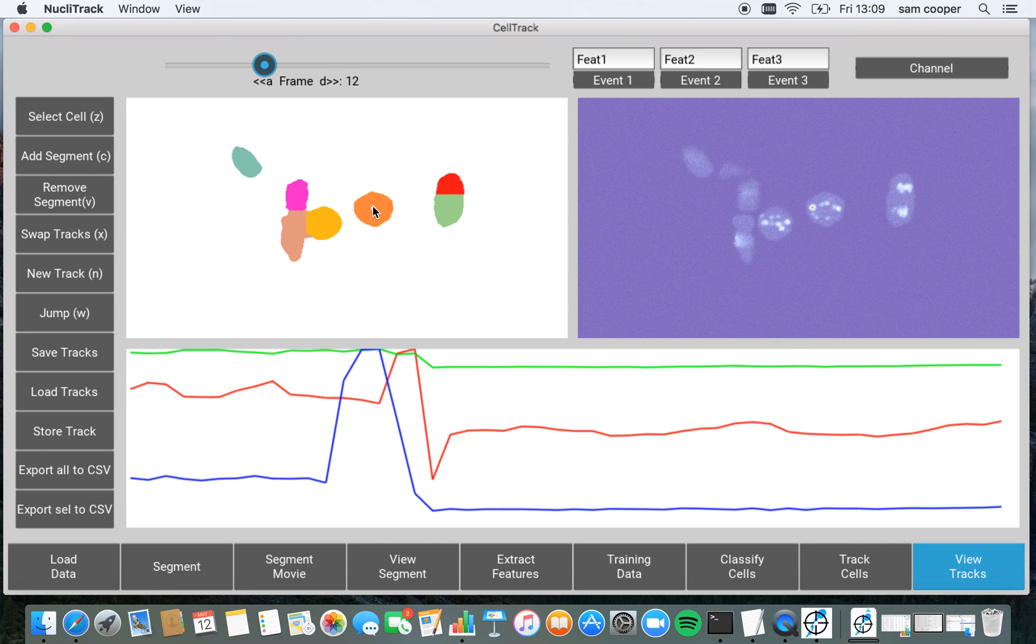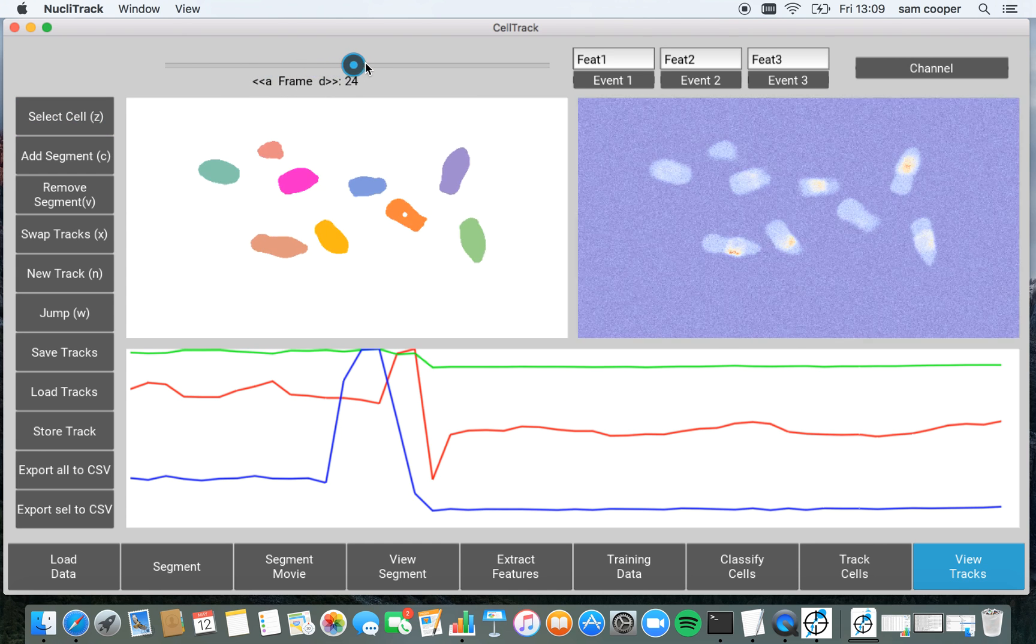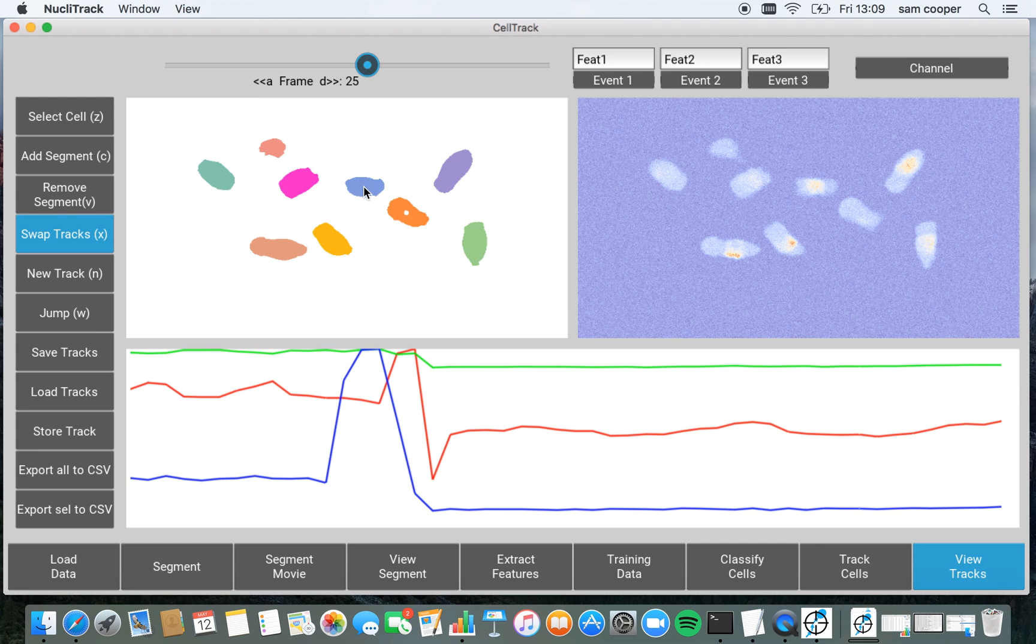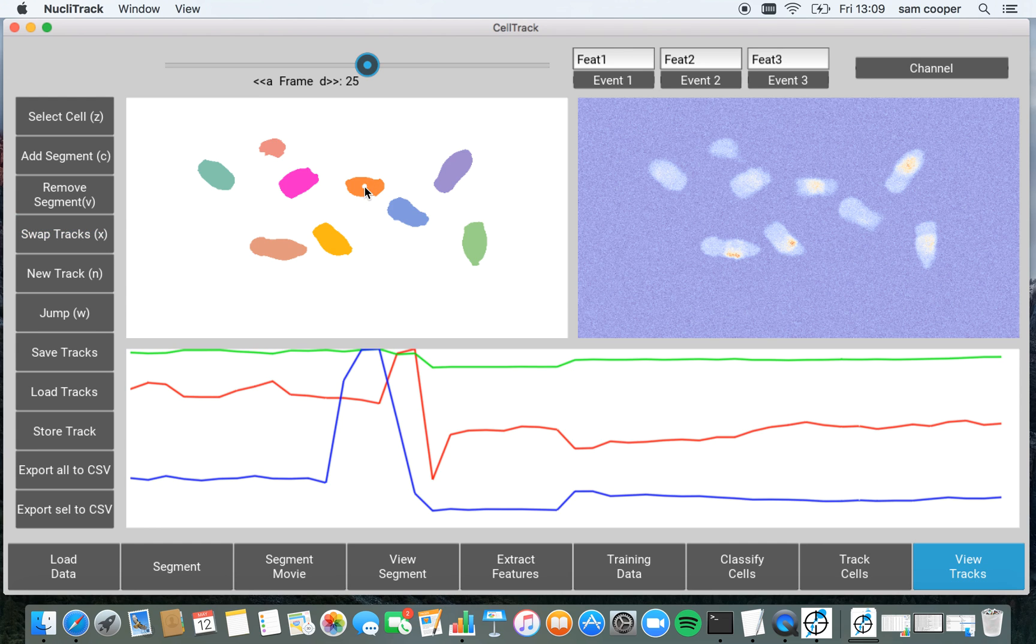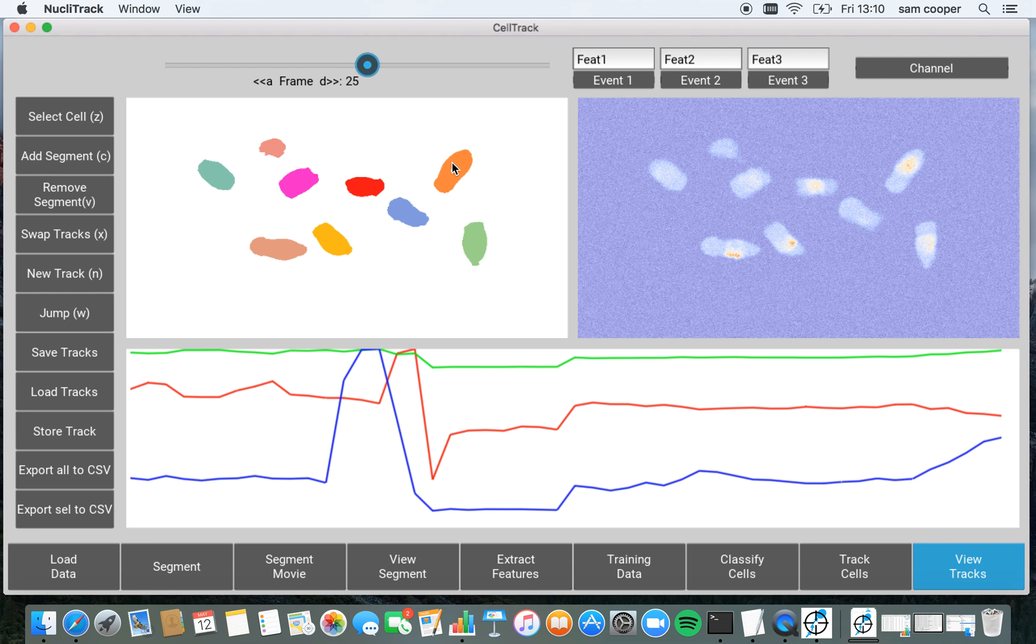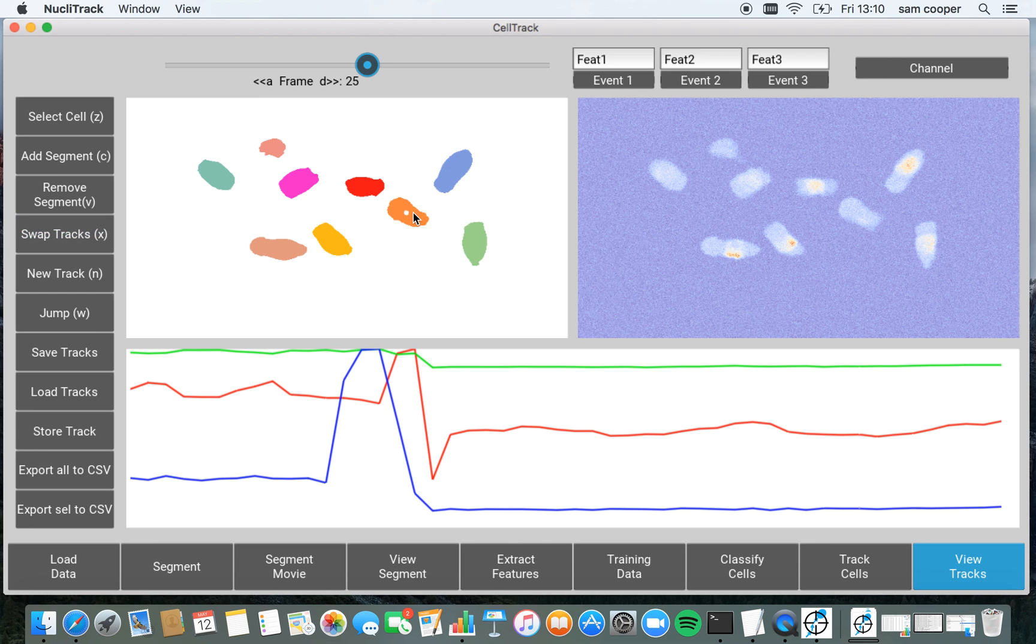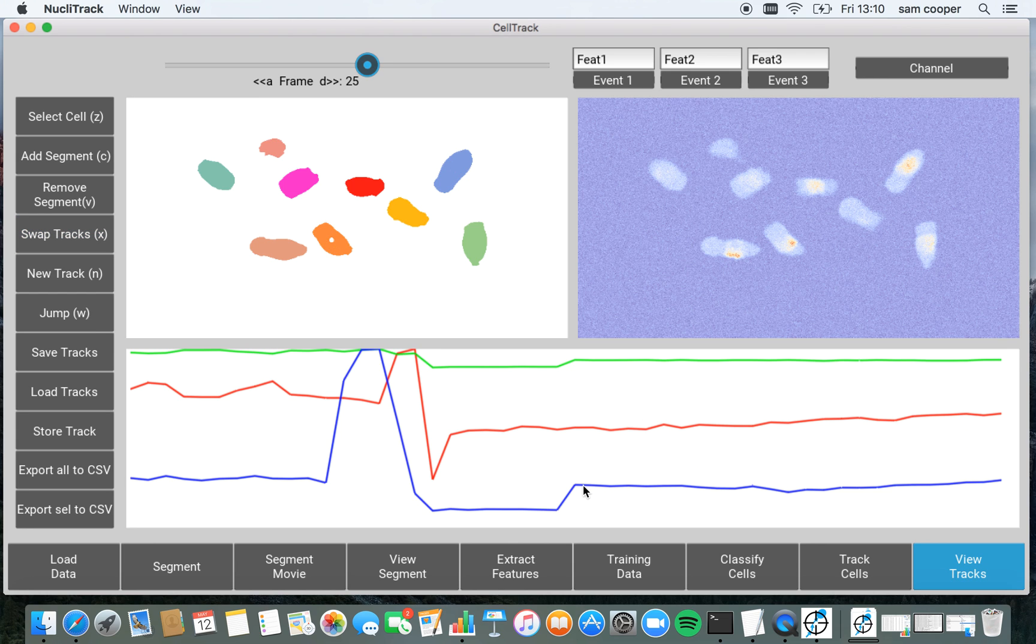So we can also use NucliTrack to make changes to these tracks. So if I highlight one of the cells, I can swap tracks with any other cell in the image. So I press X or select swap tracks from the button menu over here. I can then click on another cell and you can see that it's now swapping tracks after this time point.